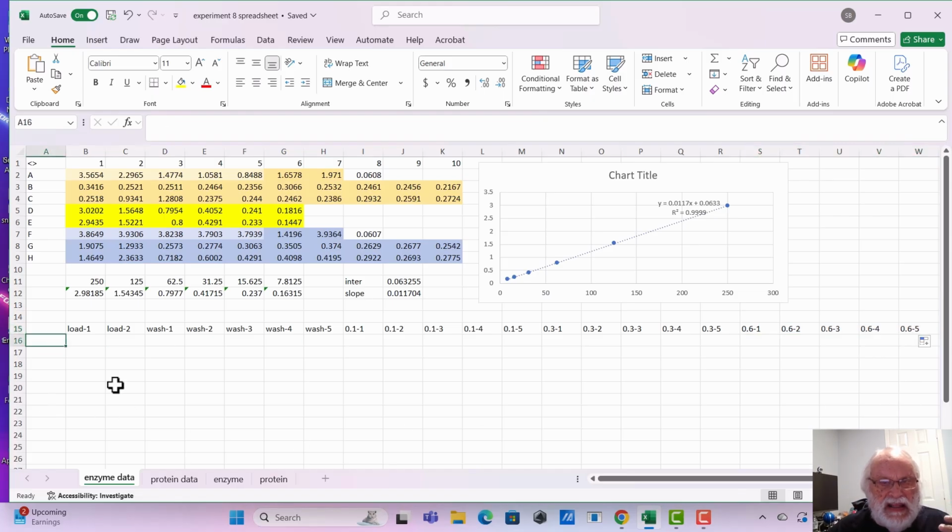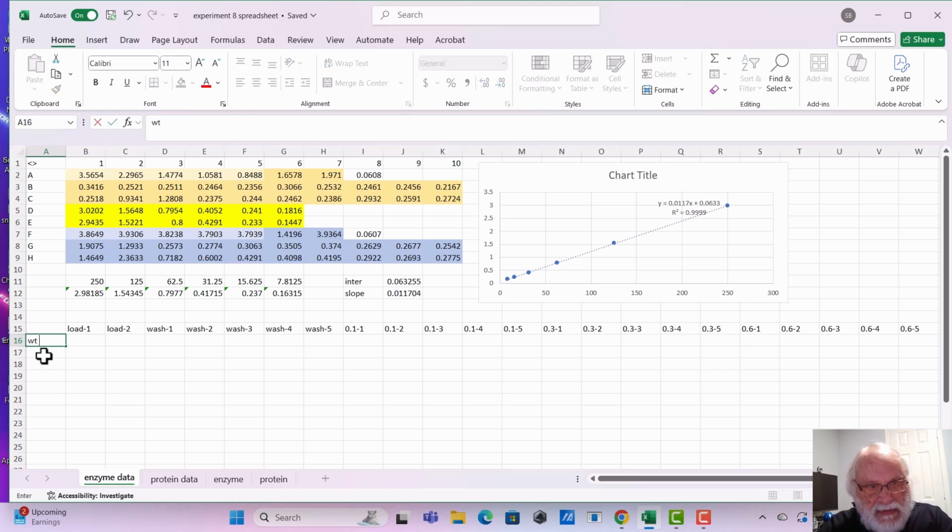Let's go ahead and calculate how much product was made in that length of time. And we're going to see that I'm not going to write it down because I told you to let it develop into a certain point, so I hope you would record that time. But let's go ahead and do that. Here we have wild type PNP absorbances. I always put ABS.